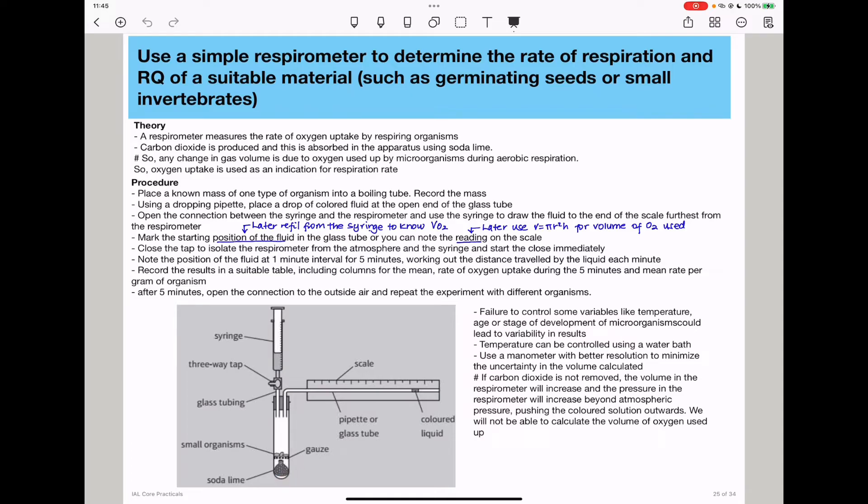At the beginning of the experiment, a colored solution will be placed into the tube, the tap will be closed, and the organisms will begin to respire. As more oxygen is used up, this colored solution is going to move towards this direction, so you have to make sure you observe the colored solution not to move beyond what you can measure if you're going to use the distance of the ruler as a measurement for the distance moved by the colored solution.